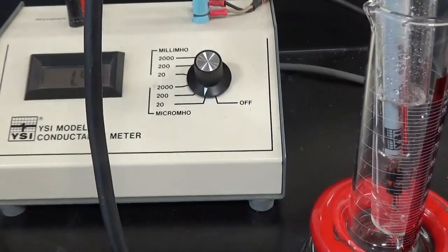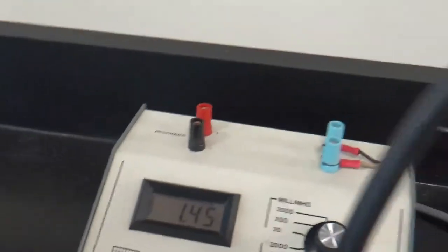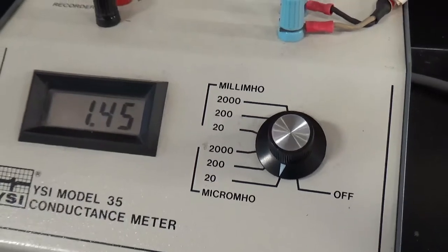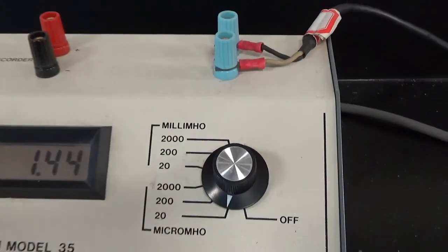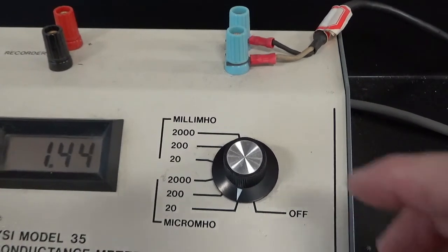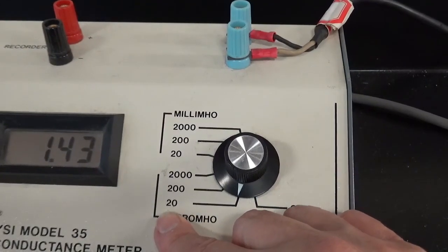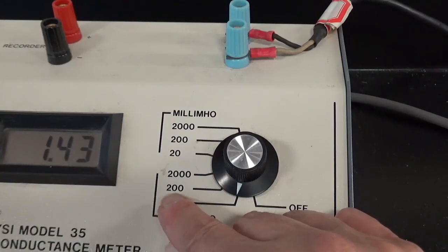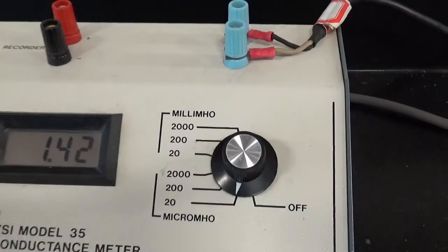Let's see, I got a number there that's about 1.5 or so. Okay, so what are the units now with this instrument? It says micromho. Okay, a mho is an inverse ohm, so it's a unit of conductivity. And when we have very small numbers, we use this scale here. This scale is for when the conductivity is between 0 and 20 micromho. If we go greater than 20, we would go to the next reading here, well, I'll show you when we get to that.